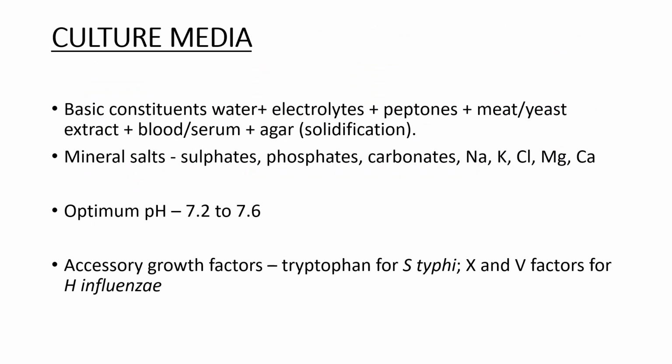Good morning, students. Today we are going to discuss culture media and culture methods. तो culture media के लिए basic constituents जो requirement होती है वो है basically water, electrolytes, peptone, meat या yeast extract, blood, serum भी use कर सकते हैं and especially the agar which is used for the solidification purpose.